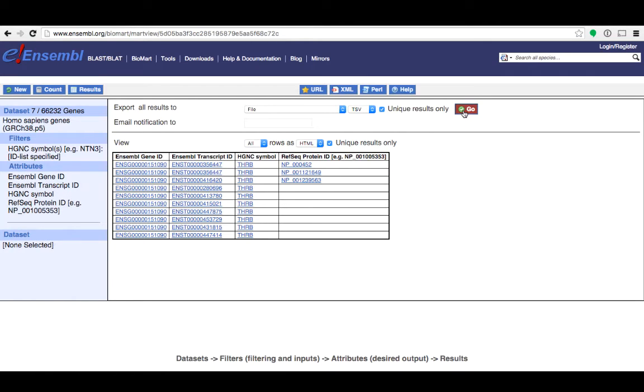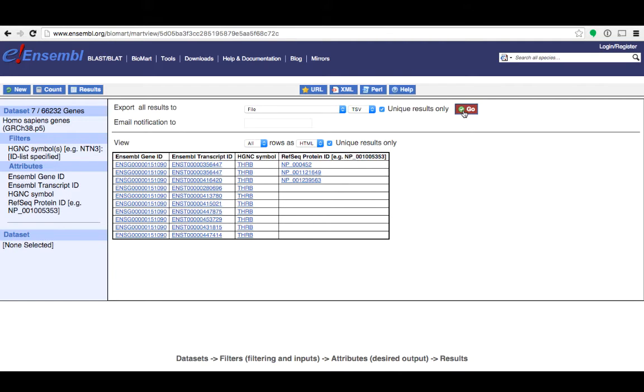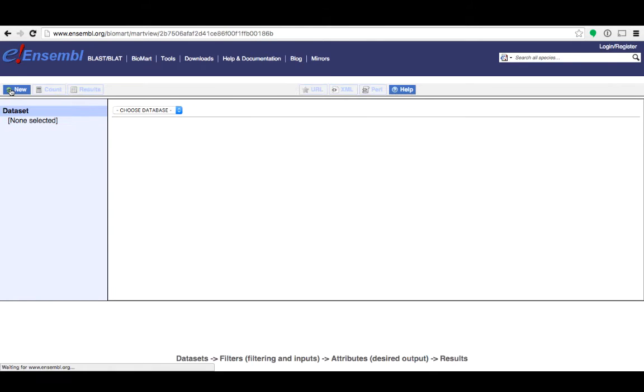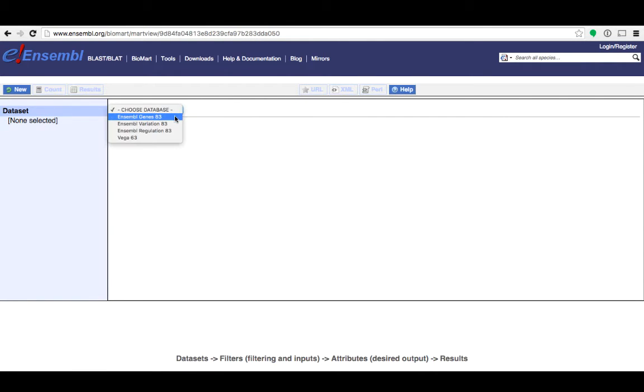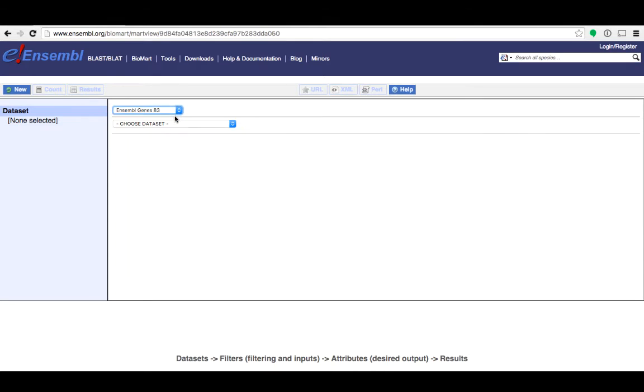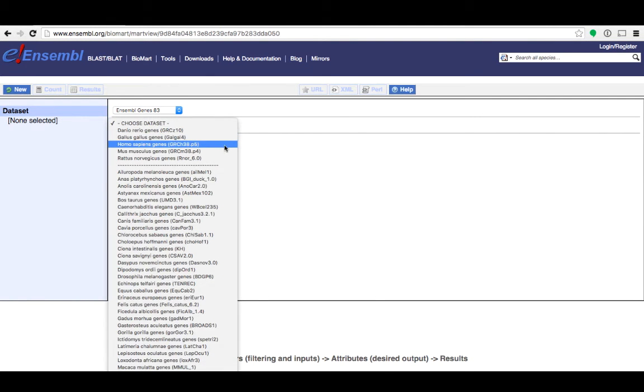In the first example I showed you how to export a table with your data. Now I'll demonstrate how you can use Biomart to download sequences. For this search I'll export the sequences for all the protein coding genes within certain genomic coordinates. I'll start a new query using the gene database of the mouse genome this time. Clicking new will clear any previous selections.